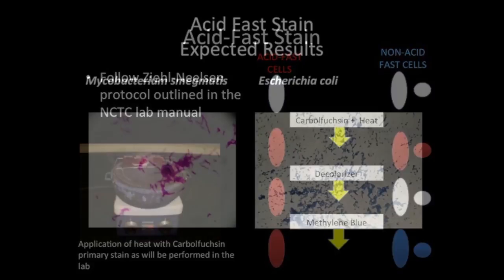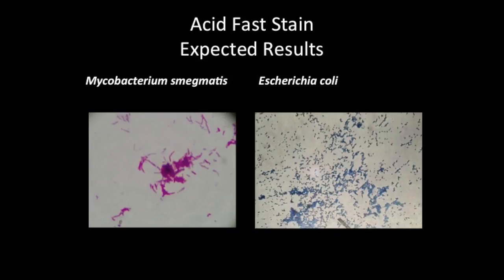Let's take a look at some expected results for your lab session. You will be examining all five species listed in exercise 3 of your lab notebook. Mycobacterium smegmatis is an acid-fast rod. Some things to take note of when examining your samples is that Mycobacterium species clump together and demonstrate a phenomenon known as cording. The waxy cell walls make the cells of mycobacterial species sticky, so they tend to clump together. Cording is the tendency of mycobacterial cells to grow end-to-end, giving them a rope-like appearance. Some clumping is apparent in the image seen on the screen to the left. If you were analyzing an unknown sample, you would only be able to determine that the sample was an acid-fast rod; additional tools would be needed to determine the species.